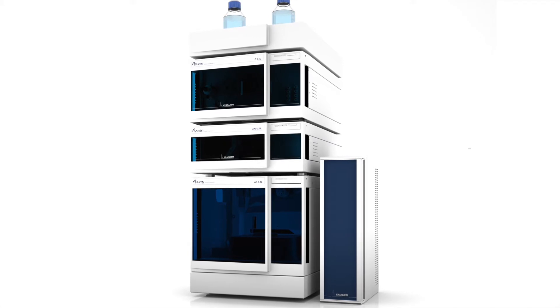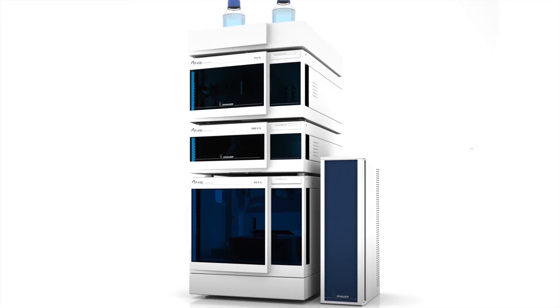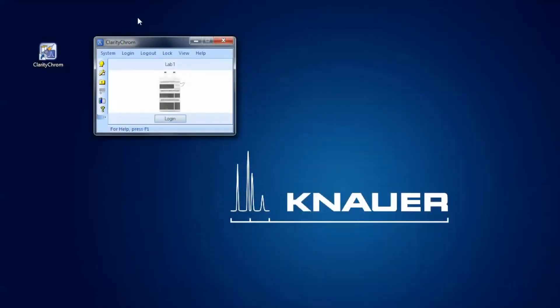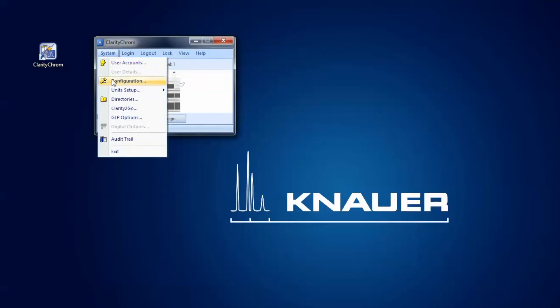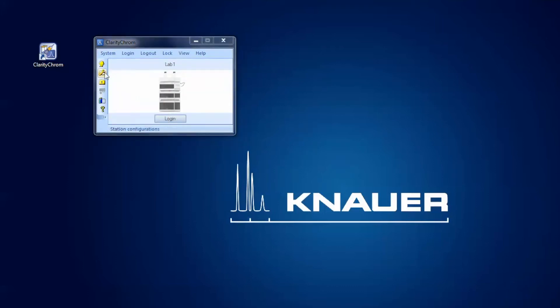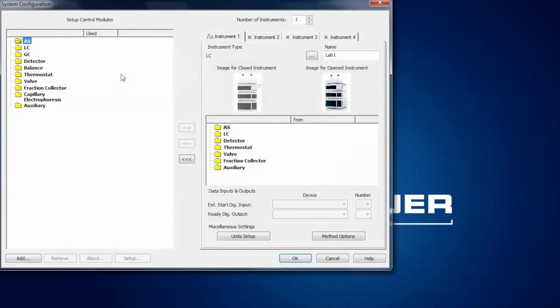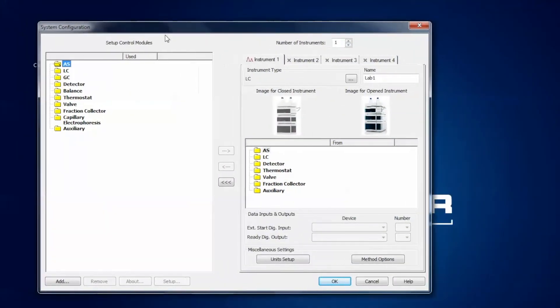To configure these four devices I have already opened the Clarity Chrome software and now I have two options to start the configuration. Either I go on the system button here and select configuration, or you can click as an alternative on the configuration icon. The system configuration window pops up and as you can see no device or instrument is configured yet, meaning the software was just installed and we have to start from the beginning.